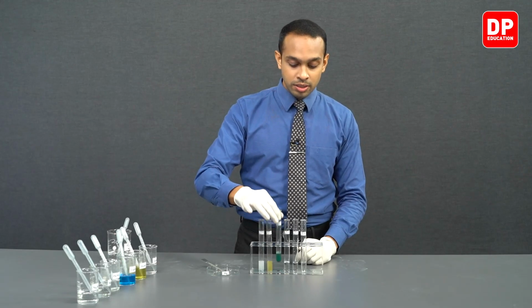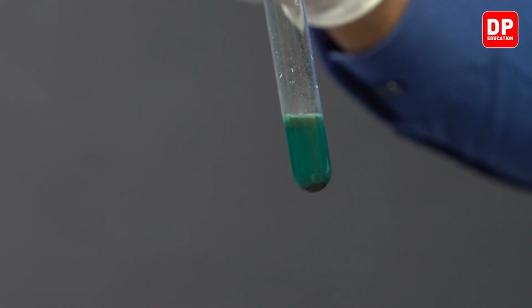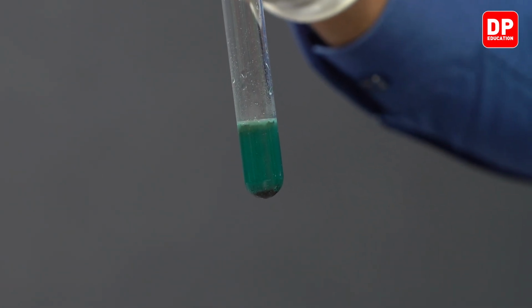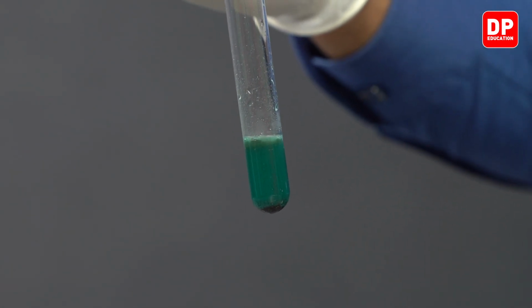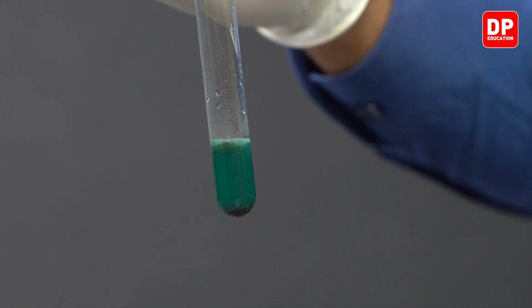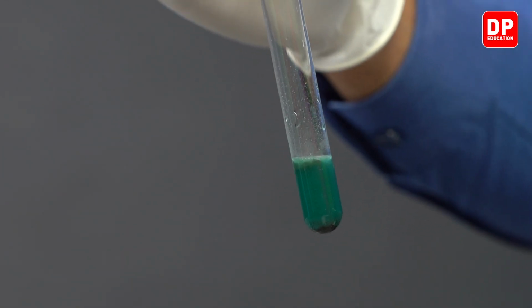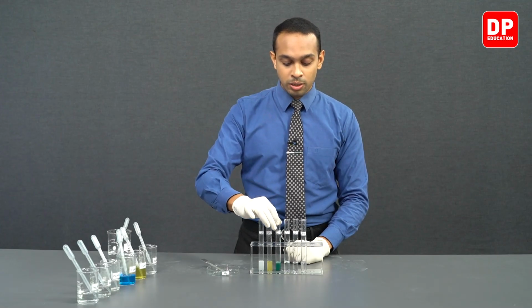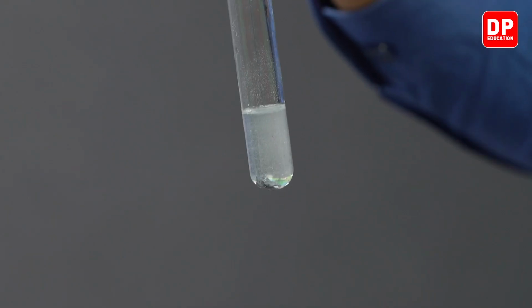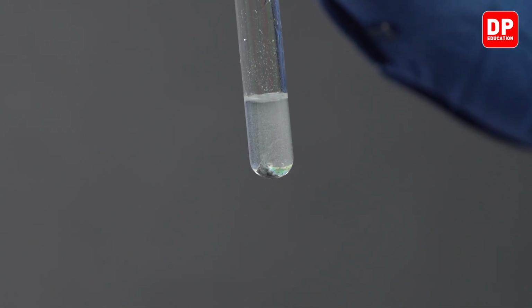But if you allow this reaction to take place for a while, now you can observe already when it comes to copper 2 plus solution, the solution has started to react with magnesium. The color of the solution also has started to change, and we can see a precipitate getting collected at the bottom as well. So there are certain solutions already starting to show very clear reaction between magnesium and the metal ions in the solution.